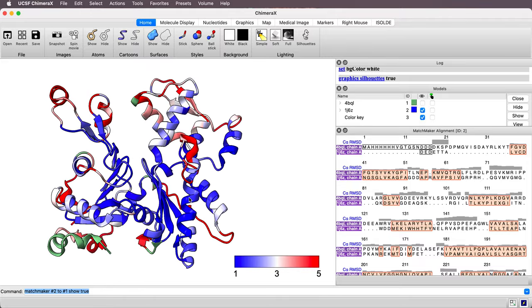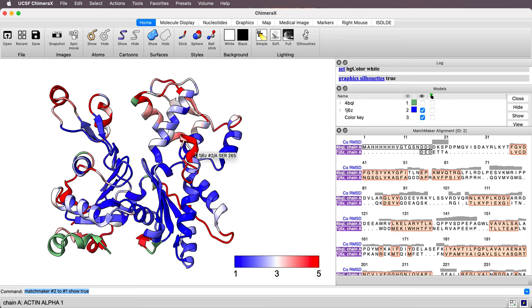The blue is regions where the C-alpha atoms are within one angstrom of each other between the two proteins I'm comparing, and red is five angstroms or more away from each other, the corresponding C-alpha.